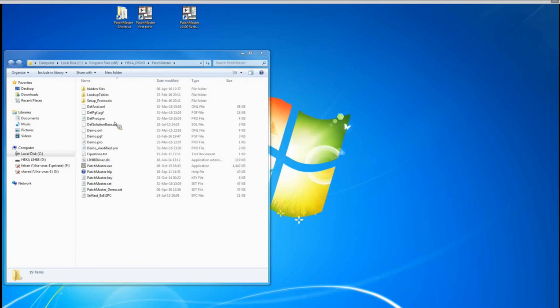Okay, now you should see my screen. This is now the start of the live demonstration. And first I would like to point out that here you can see already that the hardware is being found. Here you see it looks like a flash drive.